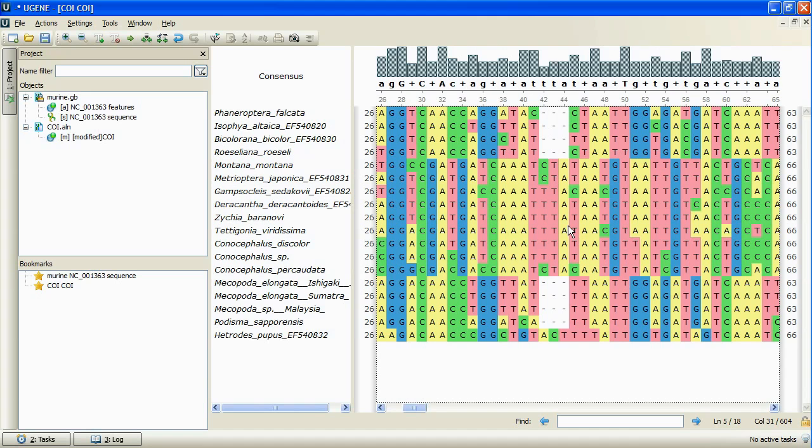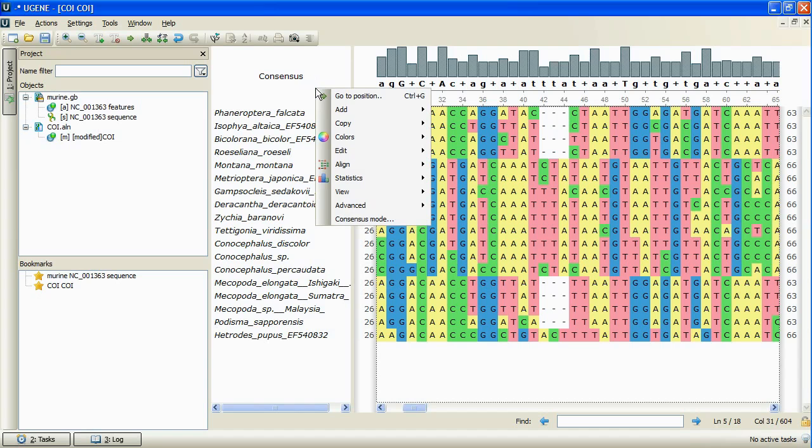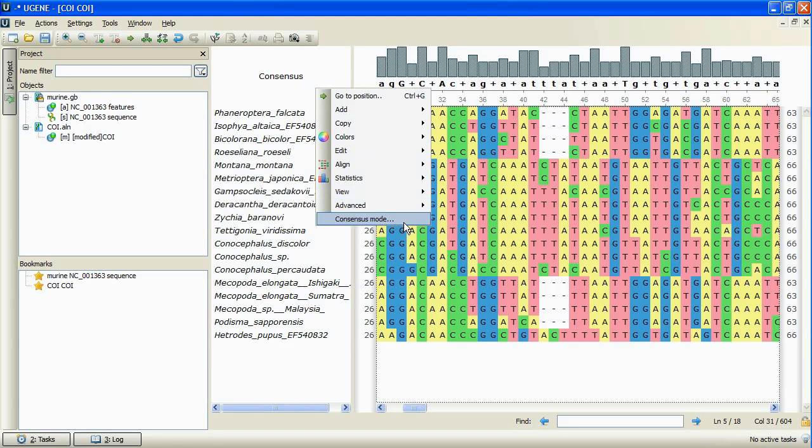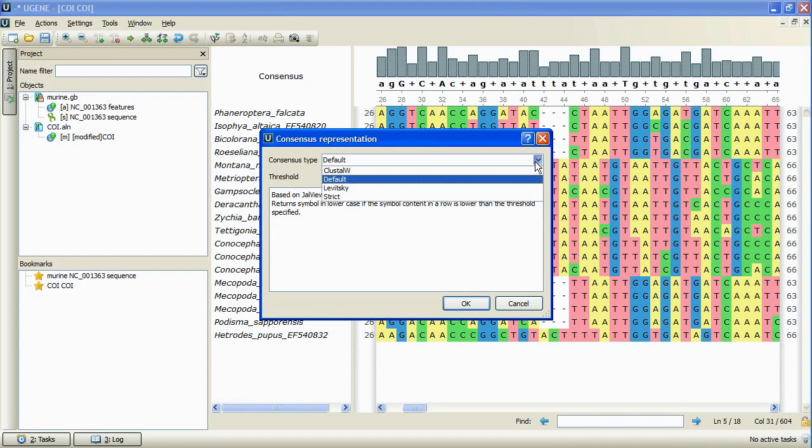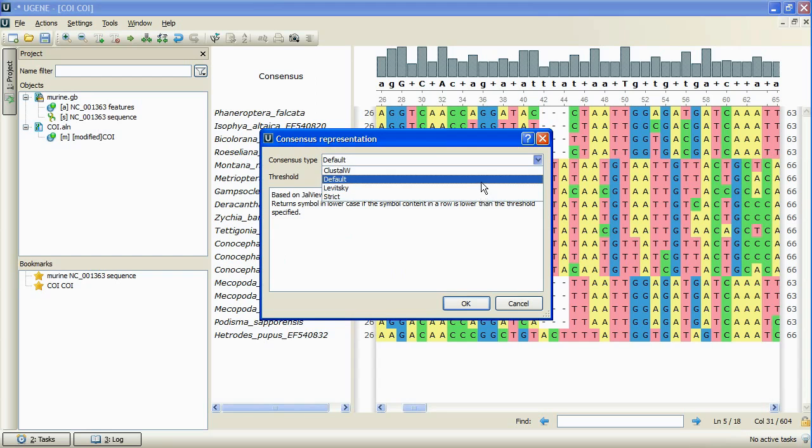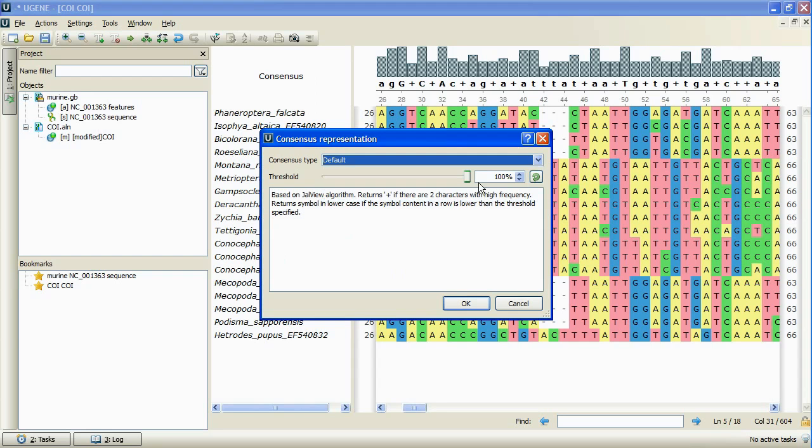Other changes concern the consensus. We bring up the context menu and select new consensus mode menu item. In the dialog box that appears, we can select the consensus type and read the information about this type.